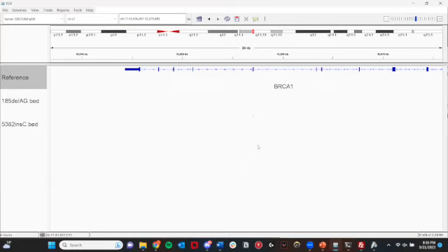So if you have that Ashkenazi Jewish lineage, then you may have a hit for that, but otherwise you can use a database like 1000 Genomes or gnomAD. You can actually check the allele frequency of this kind of area. So now if somebody says, hey, I did the BRCA1 test using 23andMe, now you get the answer properly.